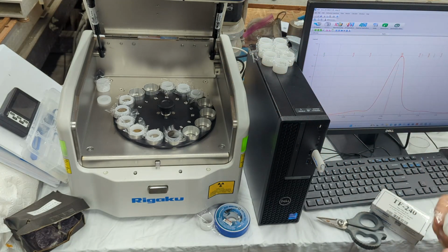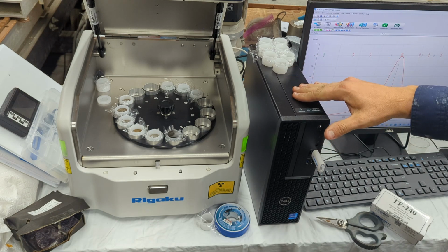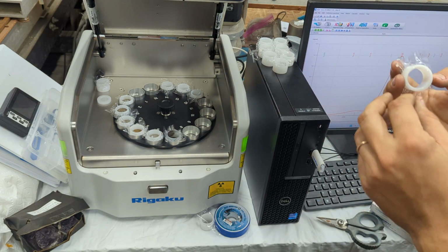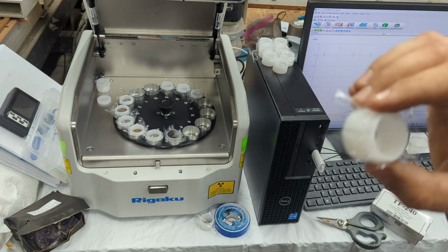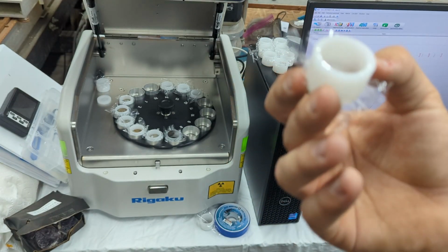You also want to do this on a piece of fabric or something. You don't want to do it on a flat surface, because what will end up happening is air will get trapped in and it can actually bust this. I'll break this open, but yeah, as you see, it's perfectly clear. Very, very nice.